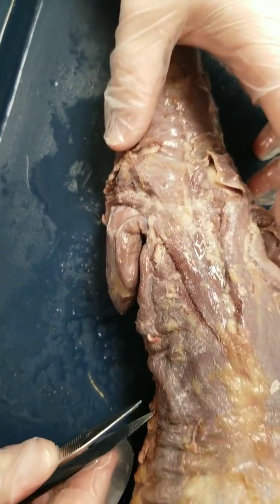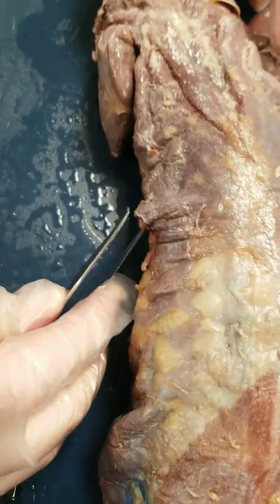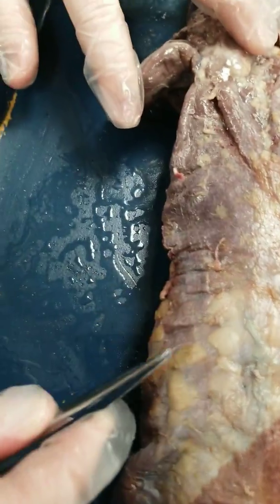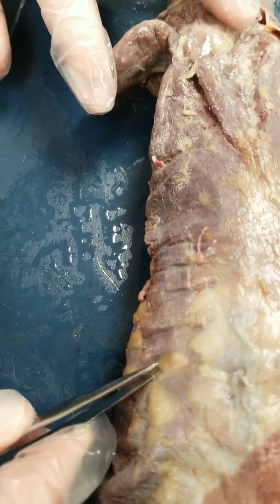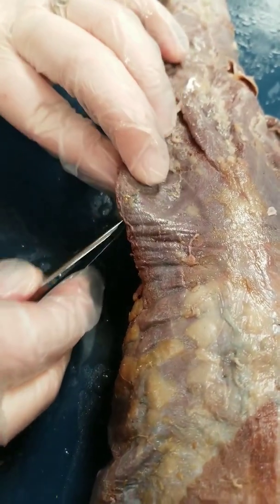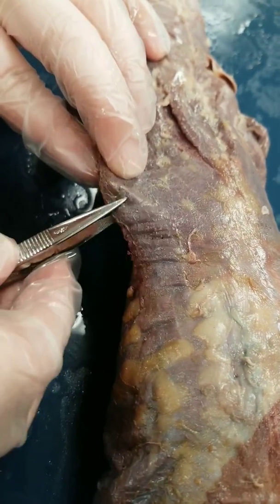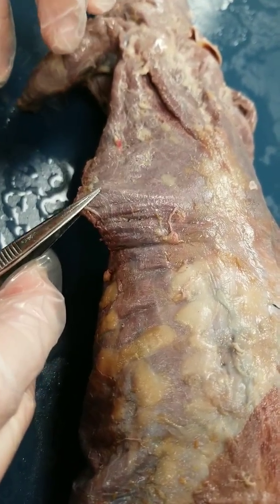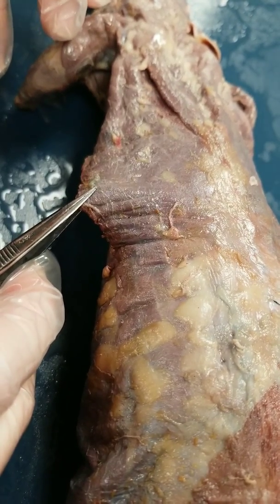The last muscle is your latissimus dorsi muscle. This is a big wing muscle — it's a large muscle. It goes all the way from the middle back all the way up, underneath the arm. You're just going to run your forceps under there and separate it so that you have a nice muscle you can hold with your forcep. That'll be your last muscle that you dissect on the mink.